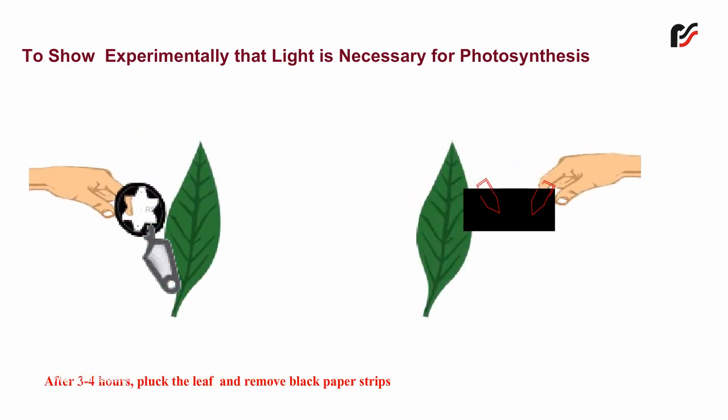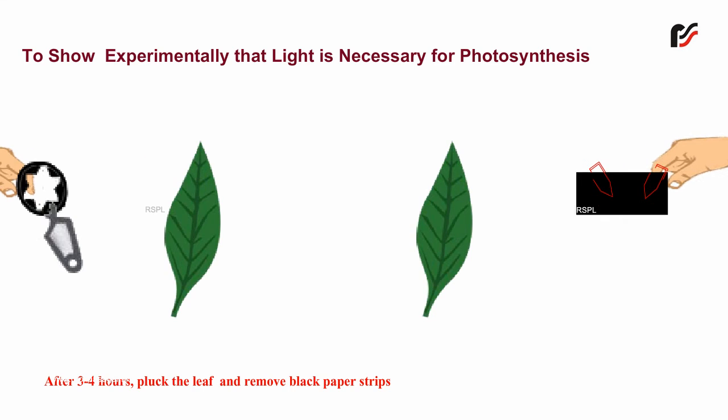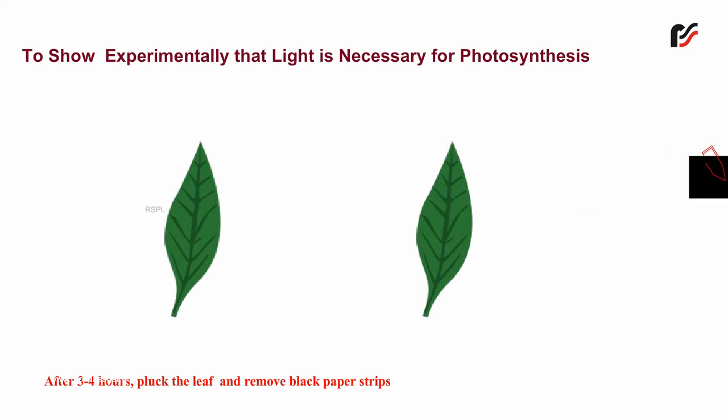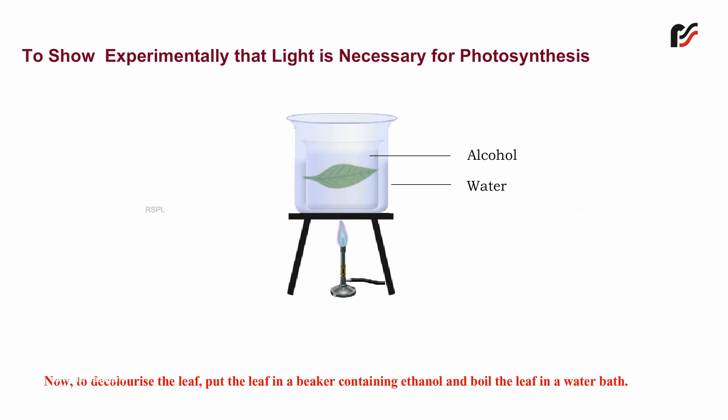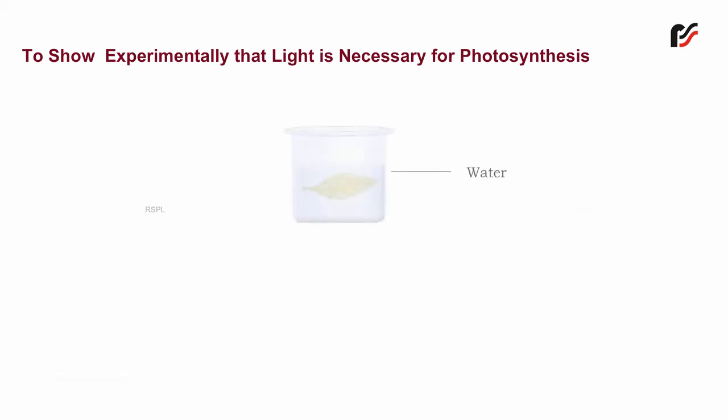pluck the leaf and remove the black paper strips. Now, to decolorize the leaf, put the leaf in a beaker containing ethanol and boil the leaf in a water bath. Remove the leaf from the beaker and wash it in water at room temperature.